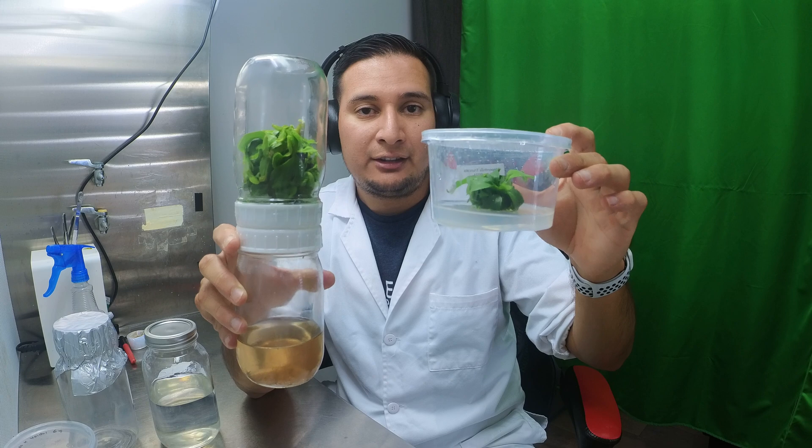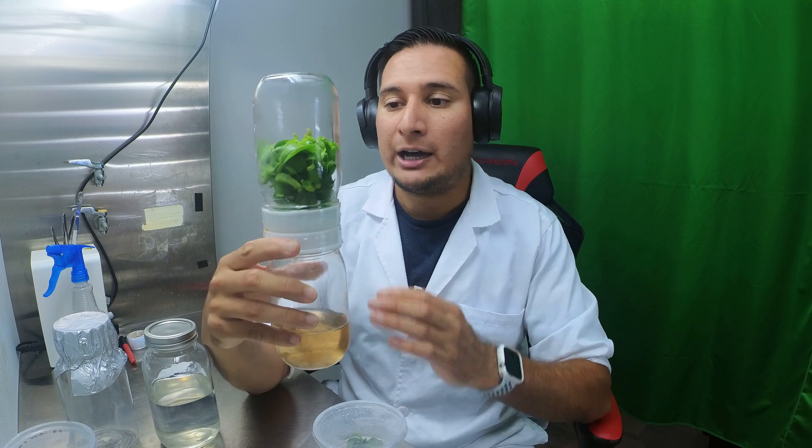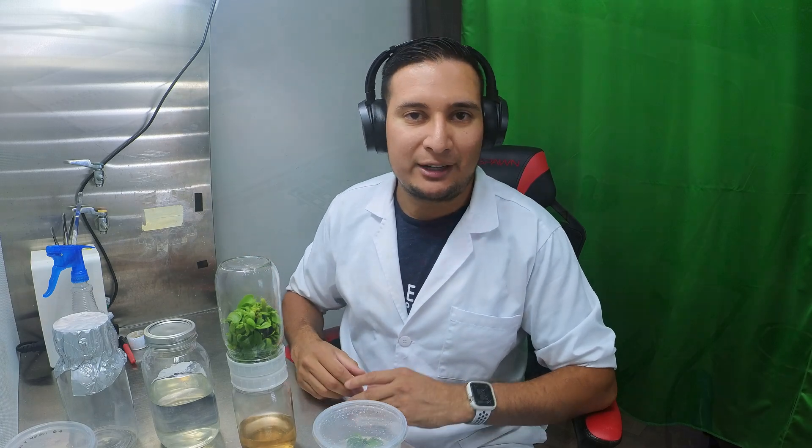As you can see, the size difference is quite significant. Not only are the plants in the biocoupler bigger, but they also have a lot more plants. Before I move the plants to a new biocoupler, I want to check out this video — basically a compilation of the whole entire process on the Nepenthes truncata.